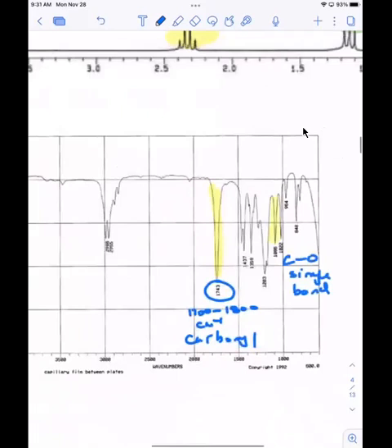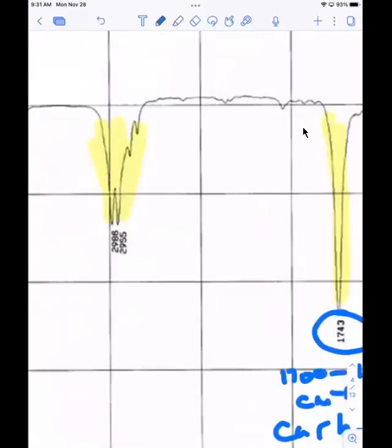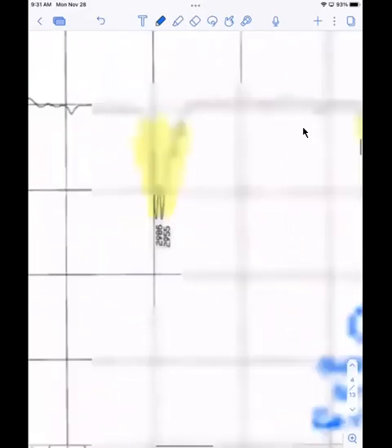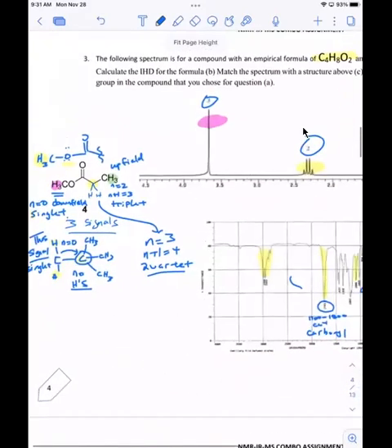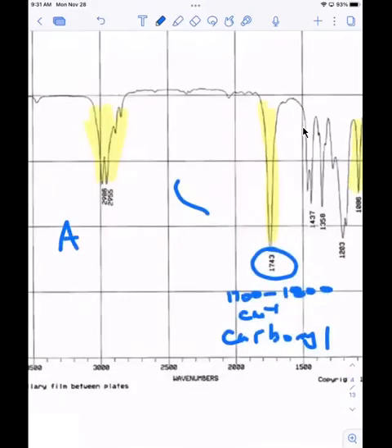And over here, this is just alkyl stretching, but it's kind of weak. It's not prominent because there are not a lot of alkyl carbons in that molecule. You only have like a 2-carbon chain, I think. Hold up, let me go back. Yeah, so this is alkyl stretching.